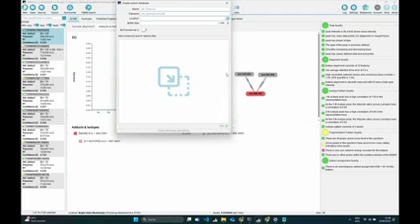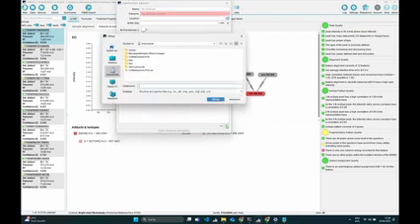Sorry, related to that. Can you explain the difference, because I played around with importing your own database. I can see there are three different flavors you could have: structures only, structures and spectra, or spectra only. Can you explain the difference? So I think what you mean is this, right? Yes.